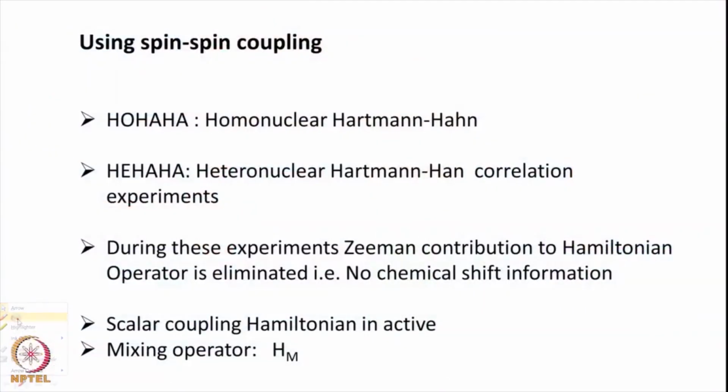For a homonuclear system the experiment is called HOHAHA, homonuclear Hartmann-Hahn experiment, and for heteronuclear it is called HEHAHA, that means heteronuclear Hartmann-Hahn. HOHAHA is homonuclear Hartmann-Hahn. So these two experiments can be done to achieve the polarization transfer.